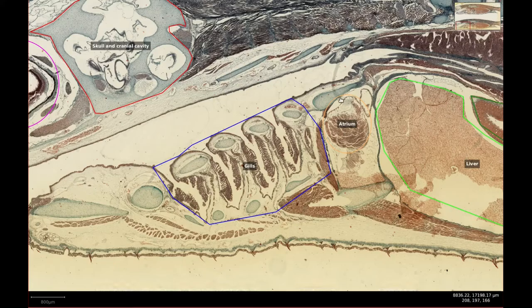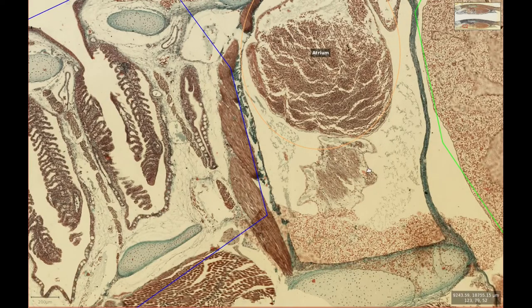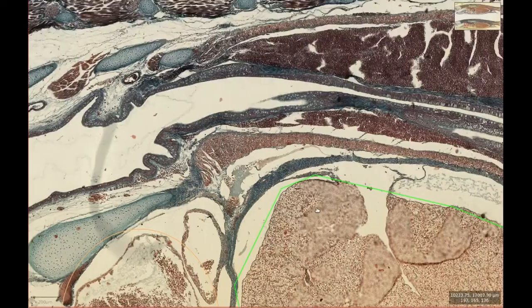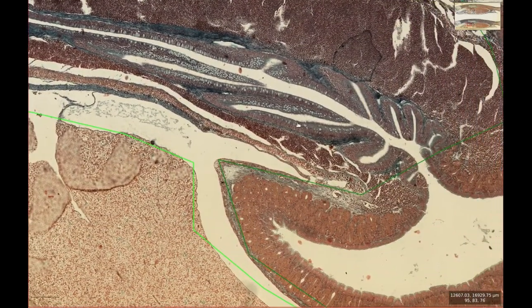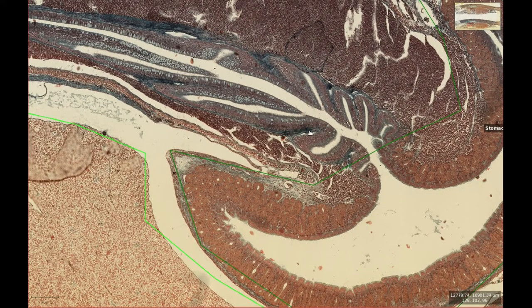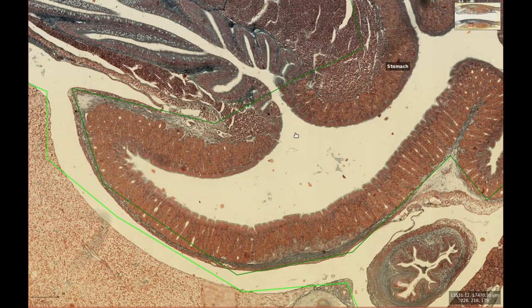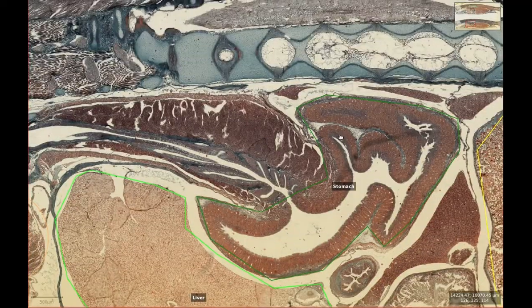Caudal to the gills there is the cardiac chamber, now containing mainly atrium with a small sliver of ventricular muscle. Again we can see the esophagus, which is entering the stomach down here. Looks like we may have strayed a little towards the midline here because we have a section of spinal cord above.